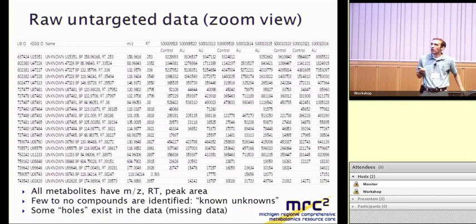Okay, so every metabolite has this, very few compounds. So some compounds out of the Untargeted platform, we do have an in-house library that we search all our database against right from the outset. So some metabolites will be ID'd in a data set.